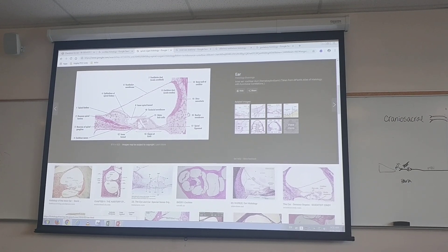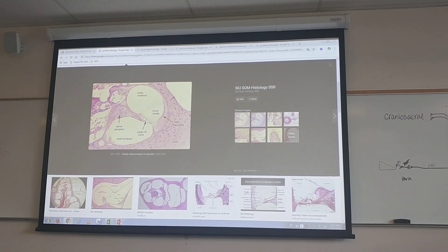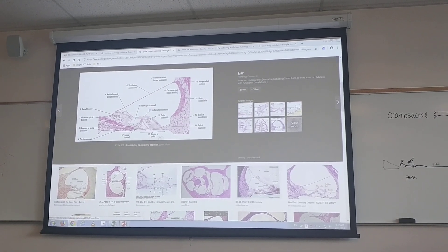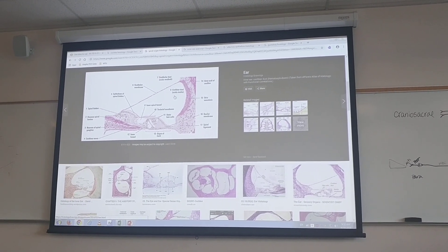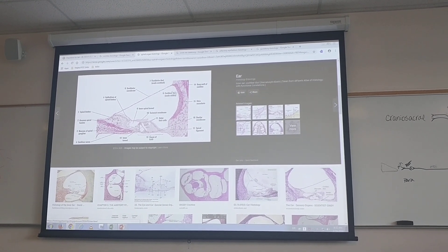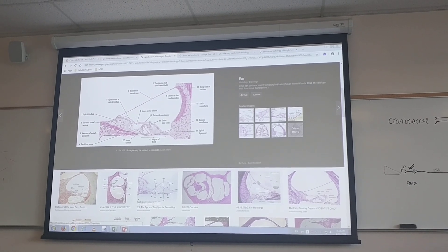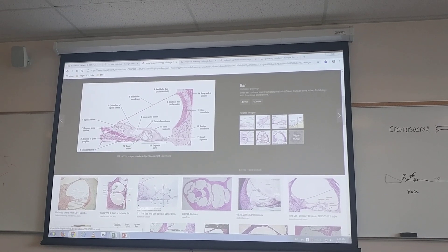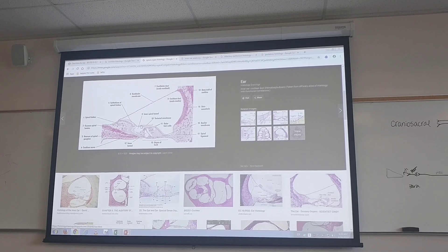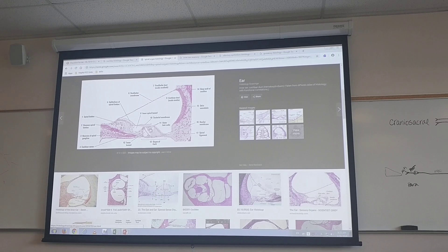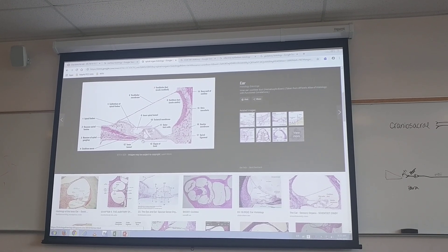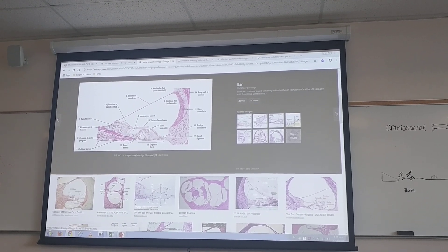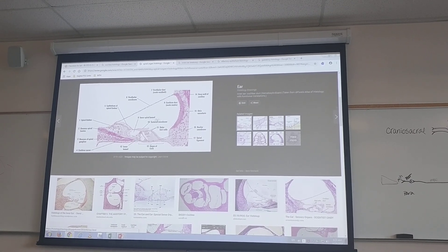Here's the spiral organ blown up. Here's the vestibular membrane — let's get ourselves oriented. There's a few things you're going to want to know. You're in the cochlear duct, which has endolymph. This membrane here, which often looks like it has a little spiral at the end, is the tectorial membrane. You can also see hair cells that come up and hit the tectorial membrane. The basilar membrane is down below the hair cells, the tectorial membrane is right over the hair cells, and the vestibular membrane is way up here — differentiating the cochlear duct from the vestibular duct.